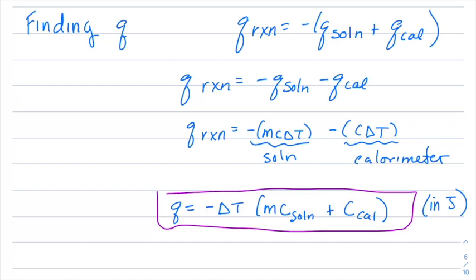So the deal is that we actually want you to see what happens when the calorimeter doesn't work perfectly. The calorimeter could either absorb some heat or it could put heat in. And often I find it depends on how hot the hands are of the person doing that swirling. So I always say in lab, try to find someone in your group who isn't normally very sweaty, because if you're really hot-handed, you will put some heat in there. But the idea is that all of the heat from the reaction either goes into the solution, meaning it's going into that water, or it's going into the calorimeter, meaning it's getting lost out from the calorimeter, unless you're very hot-handed, in which case it's going in.